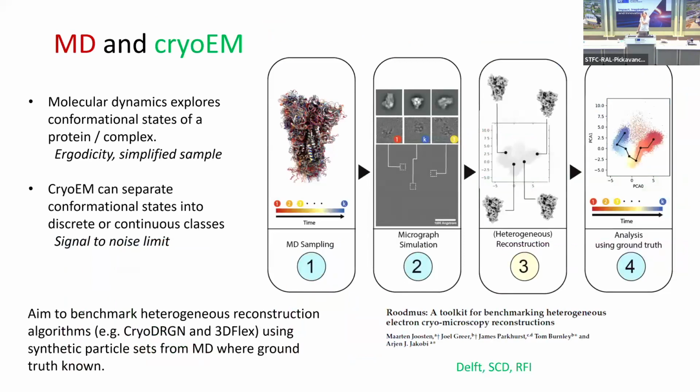And the fourth technique that I wanted to mention is going back to cryo-EM. One thing that single particle analysis can do, because you're looking at individual proteins, is that you in principle have a snapshot of all possible conformations of the protein on your EM grid. Traditionally, what is done is to classify those into discrete classes.